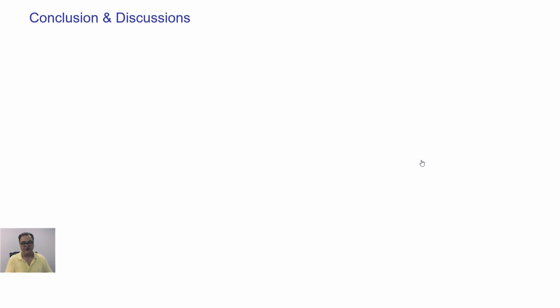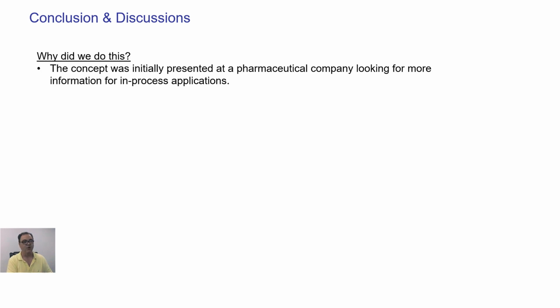So getting to the end of the presentation, why did we do this? I think this is probably the funnest slide of the entire presentation. We did this because the concept was originally initiated by a pharmaceutical company that was looking for more information. More is better. So they wanted more information, and they had at-line instrumentation that they felt could give it to them.